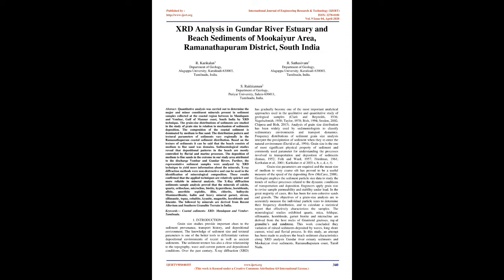The X-ray diffraction analysis of the sediment samples proved the presence of the minerals calcite, quartz, orthoclase, microcline, biotite, hypersthene, hornblende, albite, anorthite, sepiolite, chlorite, halloysite, montmorillonite, halite, and the heavy minerals garnet, zircon, sillimanite, topaz, cobaltite, kyanite, magnetite, hornblende, and ilmenite. The minerals are derived from recent alluvium and the southern granulite terrain in India. Keywords: Coastal sediments, XRD, Mandapam and Vembar, Tamil Nadu.